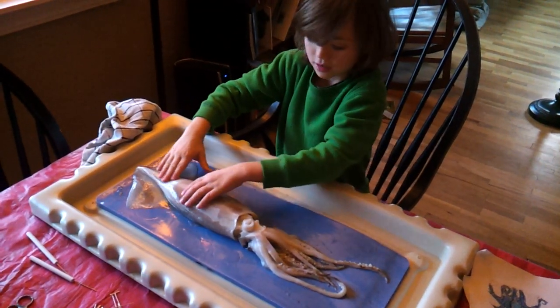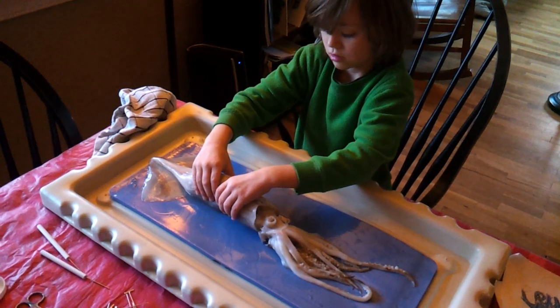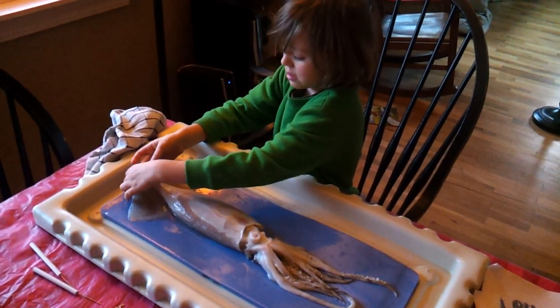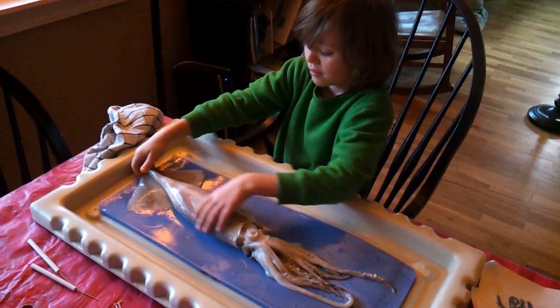What's the mantle? The mantle is the body. Okay, and you said fins — what are the fins? These things up here. And what do those do? These help the squid swim.